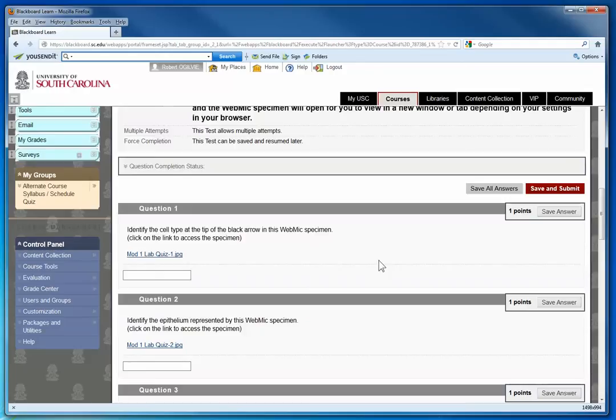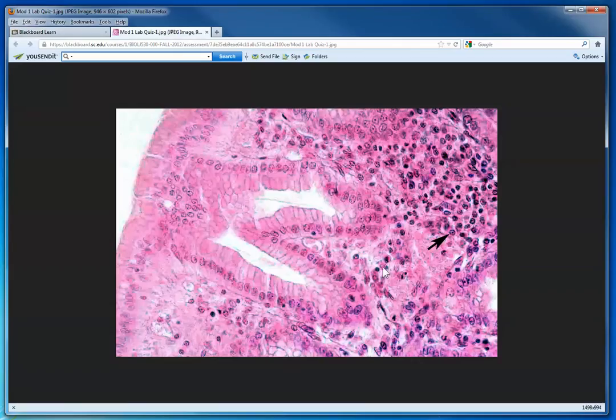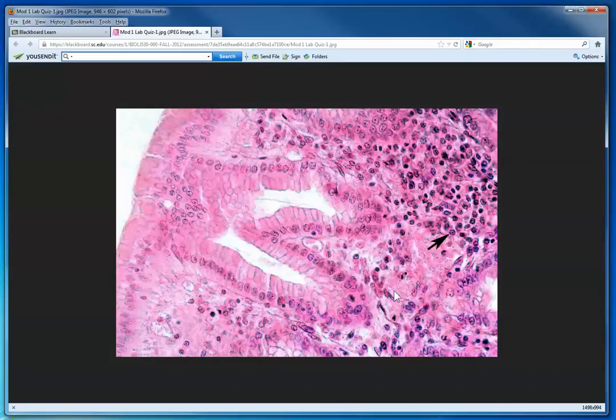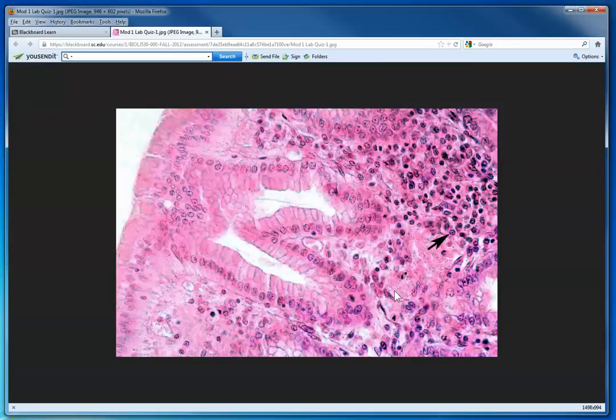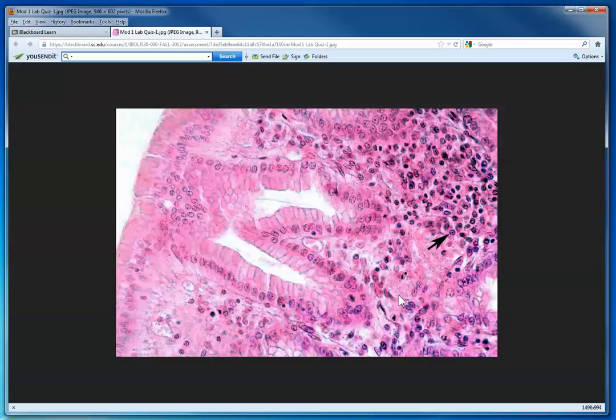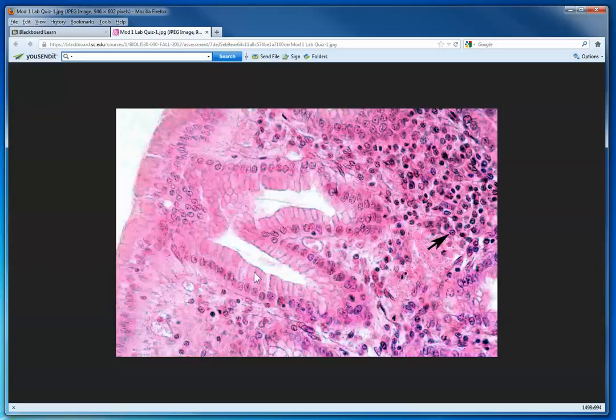I'm going to walk you through this question: identify the cell type at the tip of the black arrow. There is the cell. You have to think: I've had epithelium, connective tissue, but I haven't had muscle and nerve. There's four basic tissues, so I really only have to decide between a cell type in epithelium and connective tissue. Epithelium lines spaces in the body or tubes like blood vessels or gastrointestinal tract or the surface of the skin. You would suspect this might be epithelium here—it's simple columnar epithelium—but down here you would have to go in the direction of connective tissue.